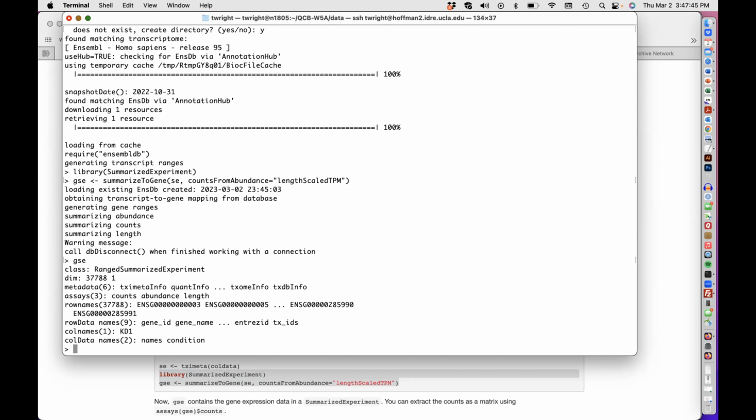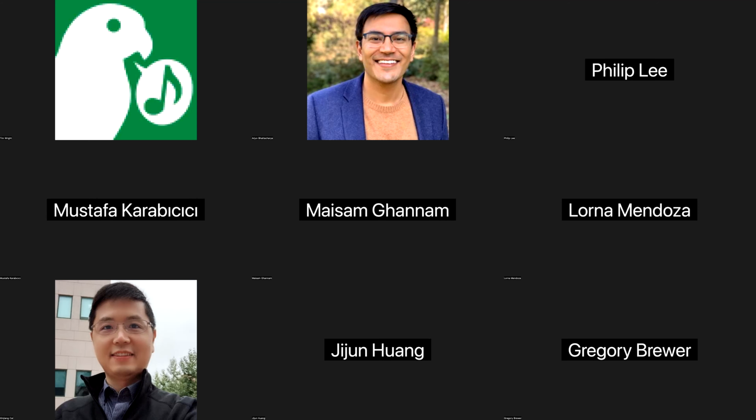Cool. So that's all I have for Salmon. So if there's any questions, we can take another 10-15 minutes so that everyone is able to run through this and have been able to do this on their own. But that's all I have.